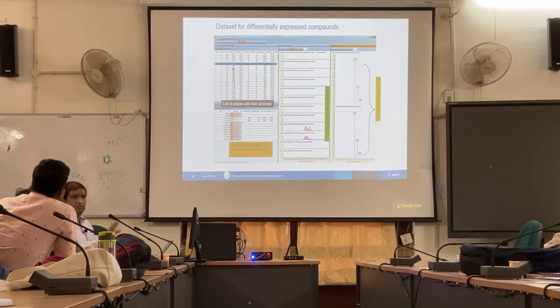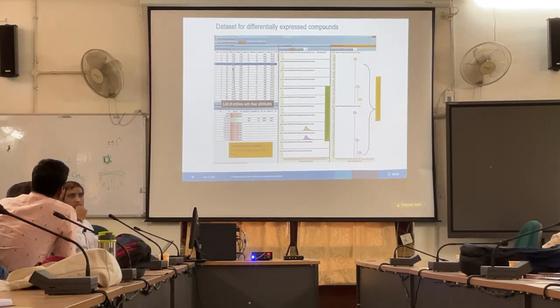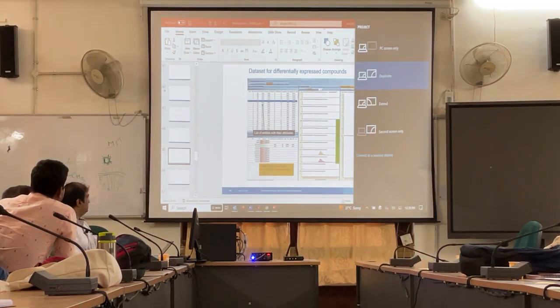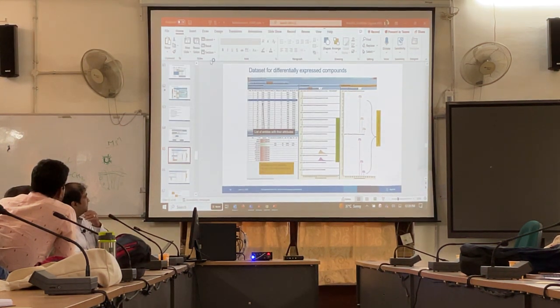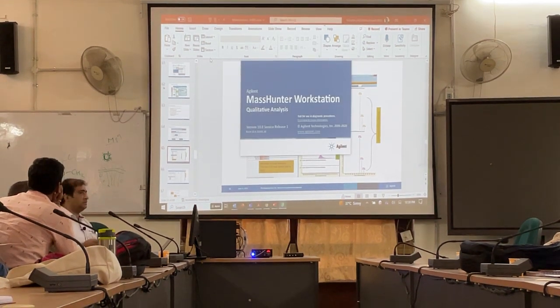You know what is EIC? The concept of EIC, BPC, everyone is clear? What is EIC, what is BPC? Okay. So I'll open this software and we'll see some data so that you know what we are talking about, what is EIC, what is BPC, okay?